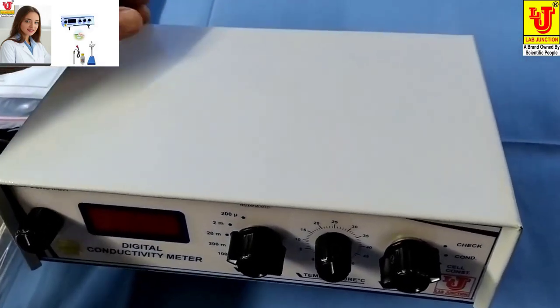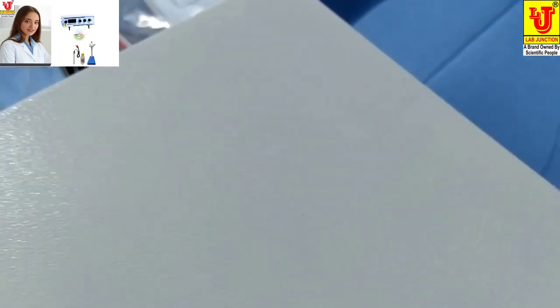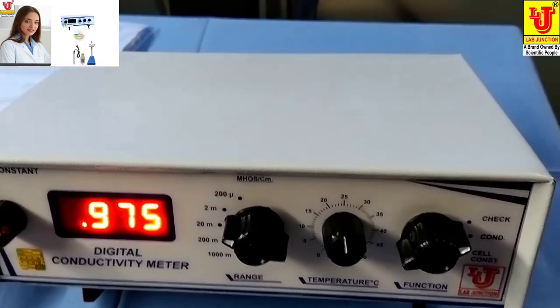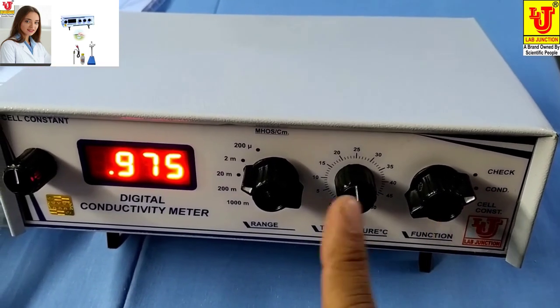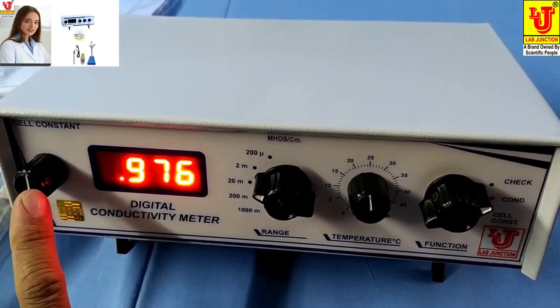I am switching on the machine. There are four controls: Function Control, Temperature Control, Range Switch, Cell Constant Knob.